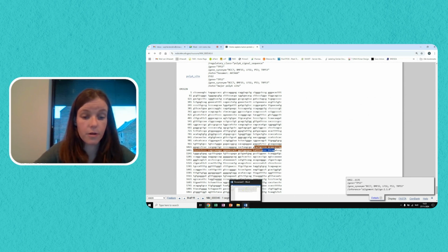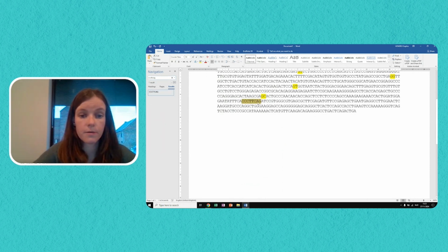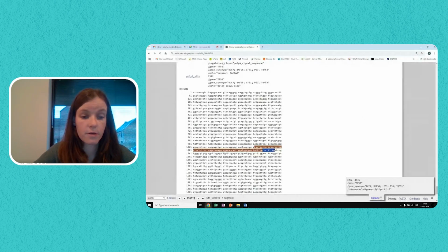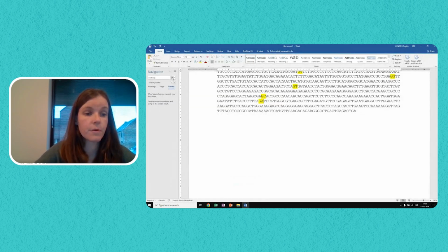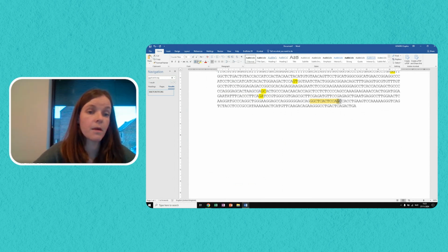Exon number 9 is located here. And this is the end of exon number 10.